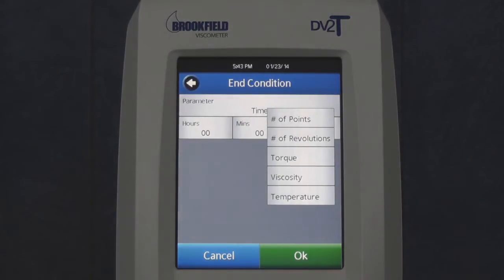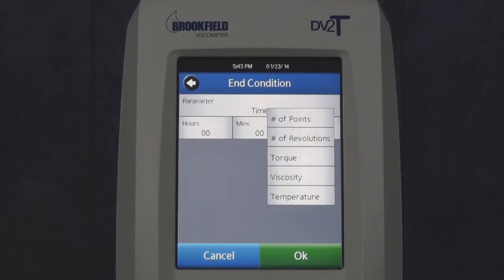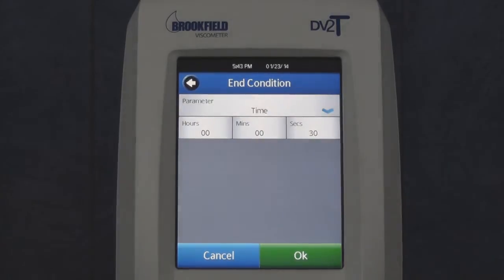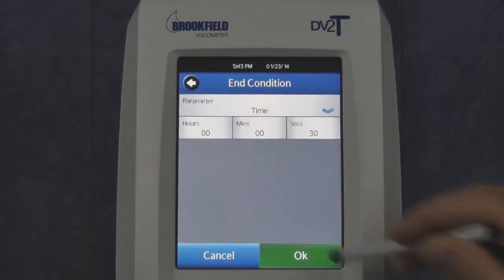There are six end condition parameters, with time, torque, and viscosity values being the most frequently used. For all of the end conditions selected, data will be collected according to the data collection setting.